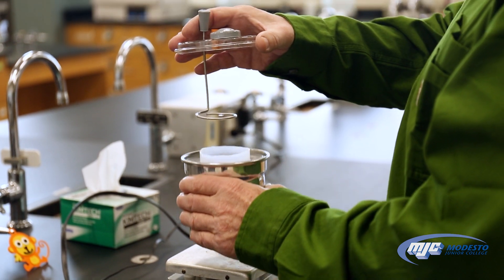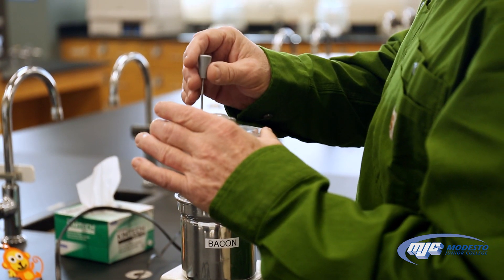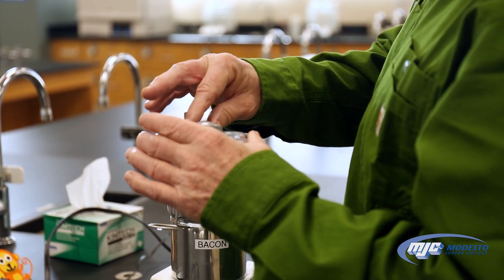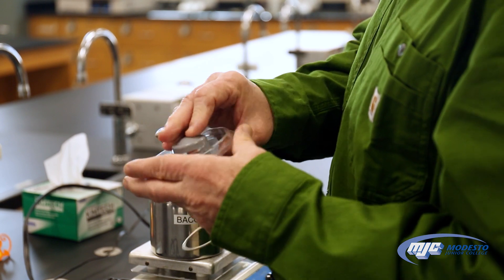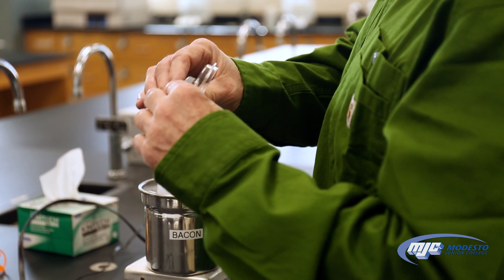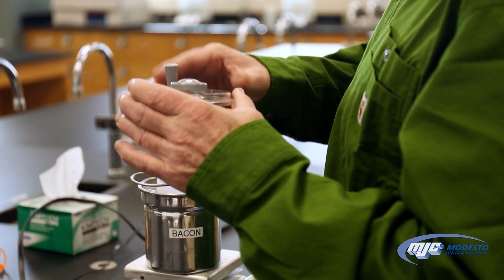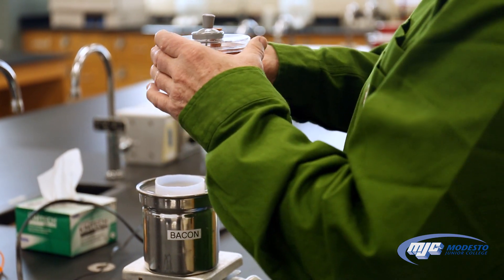It has a top on it that comes off, and through the top there's a stirrer. Sometimes we'll use this, sometimes we use a magnetic stir bar inside. This cap right here, which does come off, is used a lot of times for pouring solutions or compounds into the calorimeter, and it's the little plug where the temperature probe or thermometer can go.